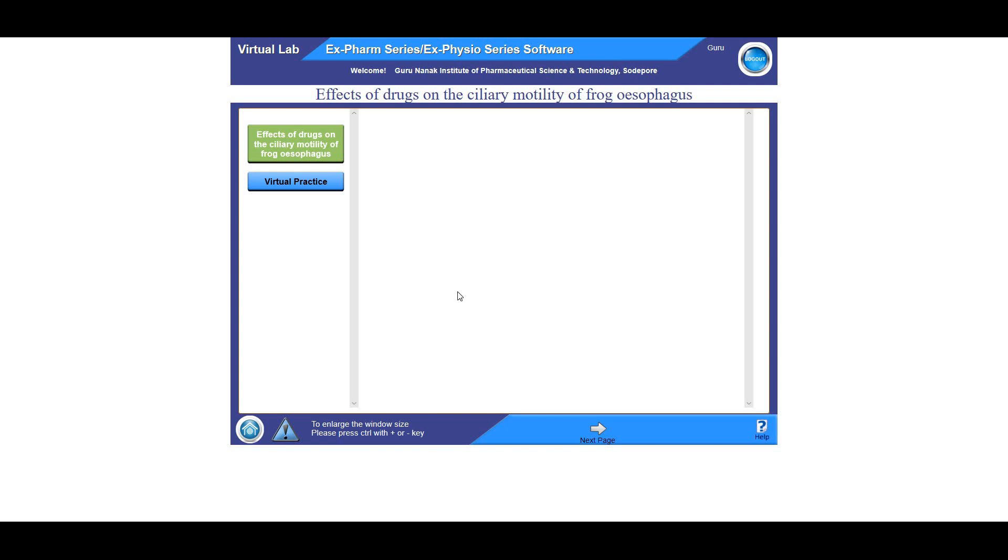Hello everyone, coming back to the virtual lab. So today I'm going to demonstrate an experiment on Xform series software that is the effects of drugs on the ciliary motility of frog esophagus.